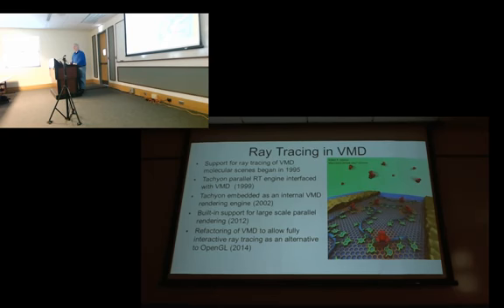Others? Yes? When adding protons to different side chains, does the plugin take into account whether there are other charged residues close by to where it adds a proton? That I don't know the answer to. Do you know the answer for that, Joe? To do what? Sorry. To add protons to different side chains. Does the script consider whether there is another side chain close by and then maybe a proton is needed or not?